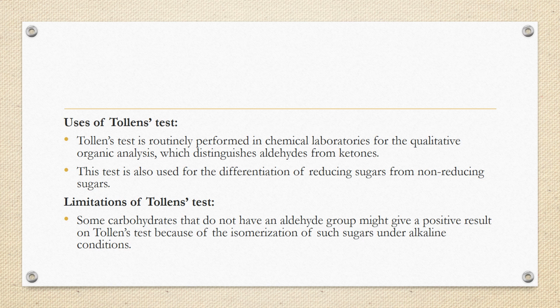So what are the uses of Tollen's test? It is routinely performed in chemical laboratories for qualitative organic analysis, which distinguishes aldehydes from ketones.